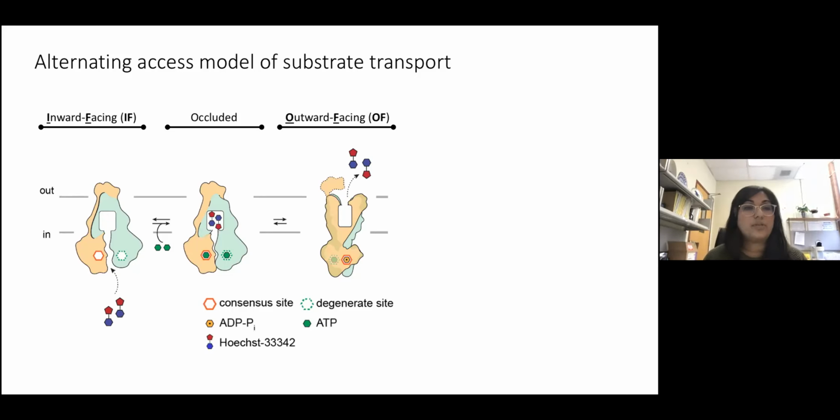And prior to cryo-EM, which has really revolutionized our ability to study ABC transporters, which for the longest time really did evade structural studies because of the complexities of their dynamics as well as substrate specificity, scientists resorted to biophysical techniques like electron resonance spectroscopy. In this technique, you can specifically label sites at important regions.